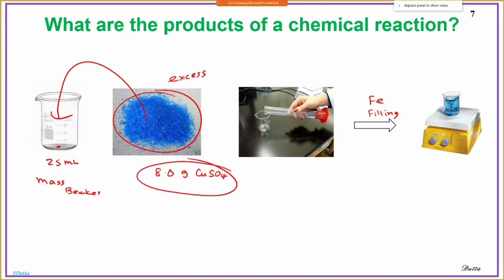I have to dissolve the copper sulfate in water. So how much water are you going to add? You are given all the information. You are given the solubility, so you can calculate. And I'm going to tell you because, for some reason, sometimes you overlook it. Okay. So you're going to use around 25 milliliters, not more than 30 milliliters. You do not have to measure out exactly because that is not the limiting. The solvent is not the limiting, but you need to add a reasonable amount. Okay. A reasonable amount is 22, 24, 25, 26, any. You do not have to spend too much time to measure exactly. Okay. Then you're going to use a hot plate.